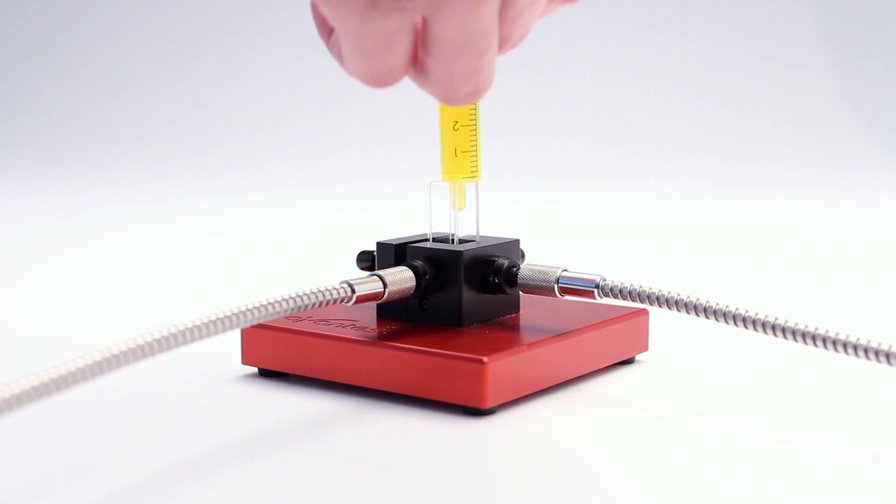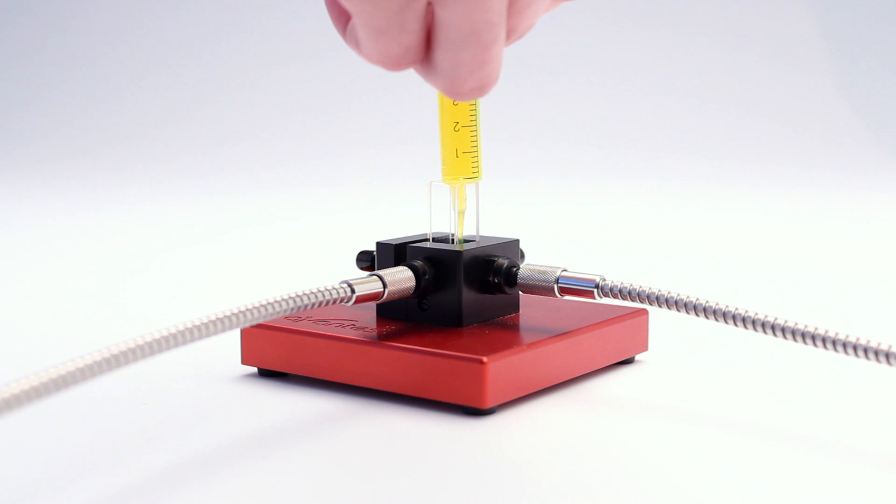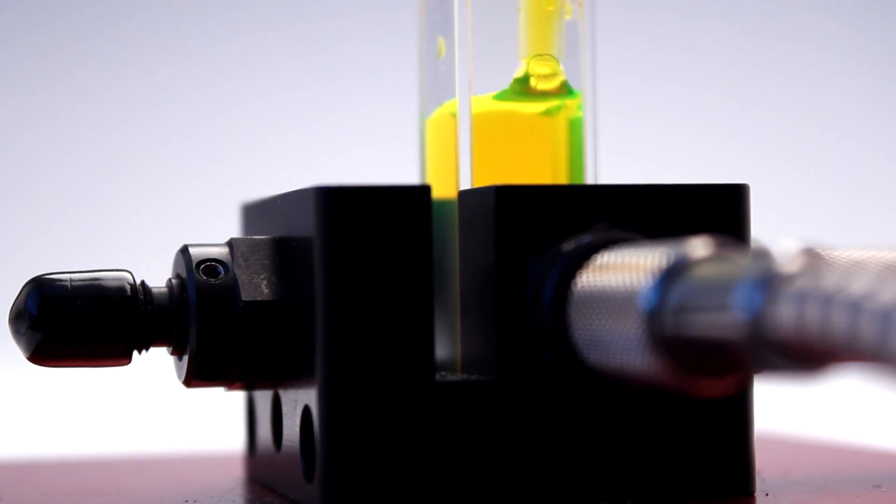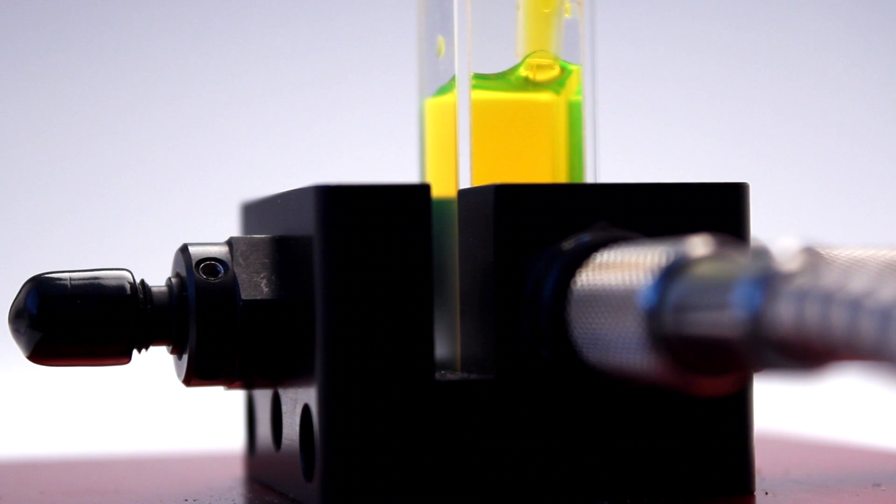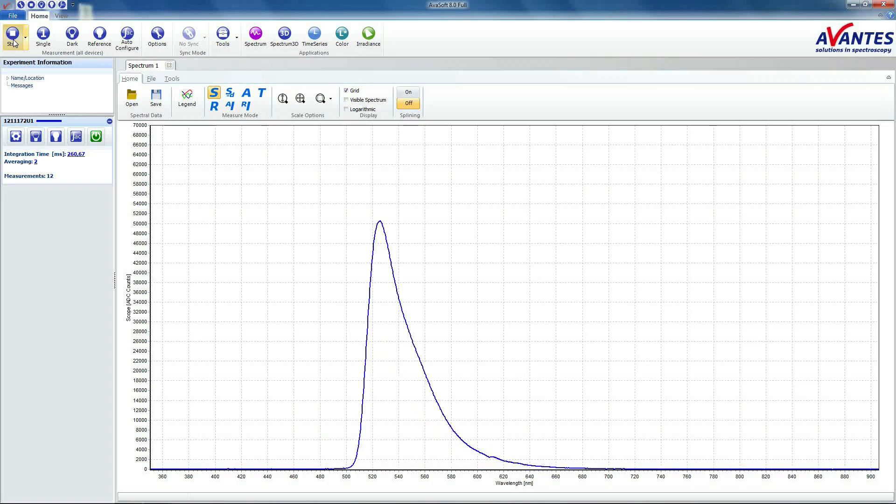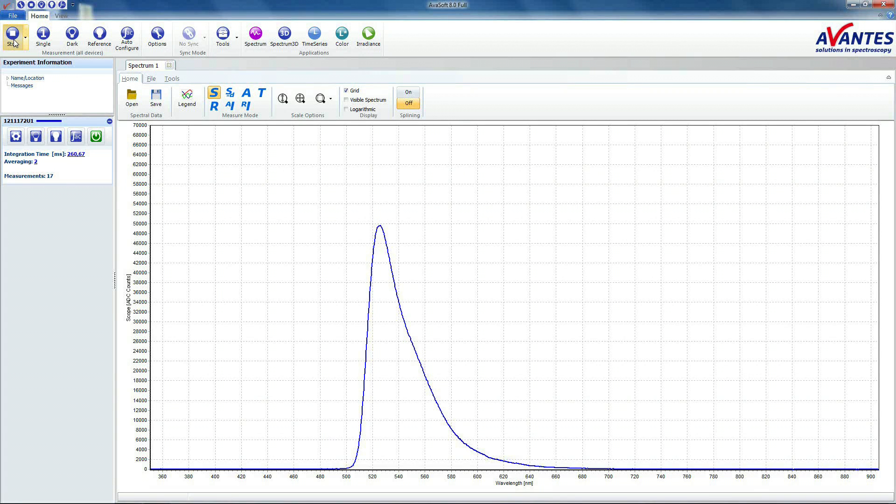Put your sample in the cuvette. Click the Auto Configure button to calculate the best possible intensity and number of averages.